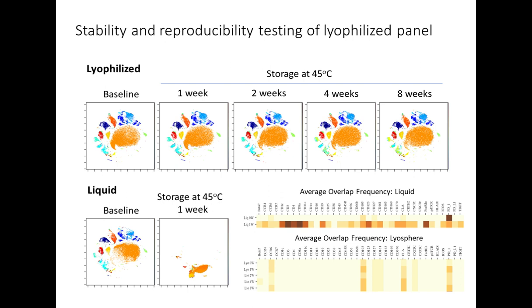Another advantage of the lyophilized panel, beyond simply looking comparable to the liquid panel, is that we expect that this does provide enhanced stability of our panel over long periods of time. And one way to evaluate this is to do an accelerated stress test at elevated temperatures.